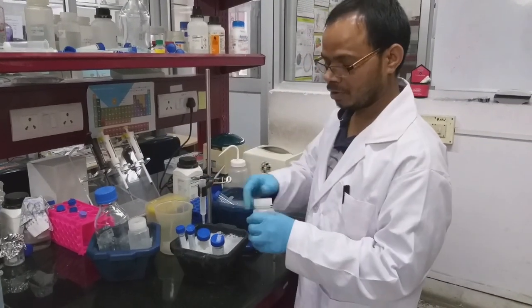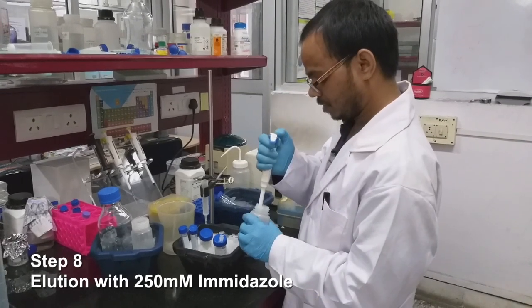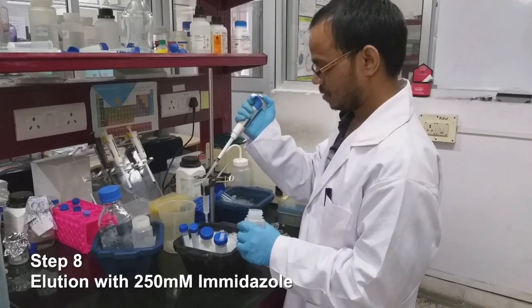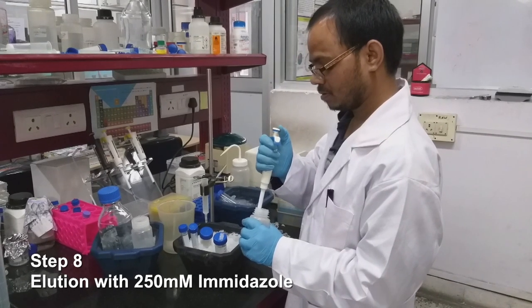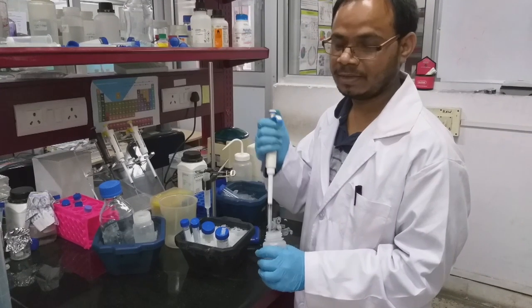In the final step, we are going to elute with 250 millimolar imidazole containing buffer. So what we are going to do is incubate the beads with this buffer for some time and collect the fractions.